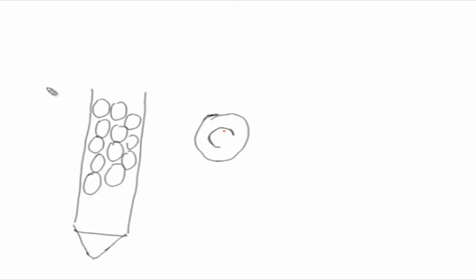To make you understand porosity, if this is the pore size, a molecule which is bigger than this pore size cannot enter here, but a molecule which is smaller than the pore size can enter into the pores. It can access the inner volume of this bead, which is the trapped solvent or trapped mobile phase, but the larger molecule cannot enter.